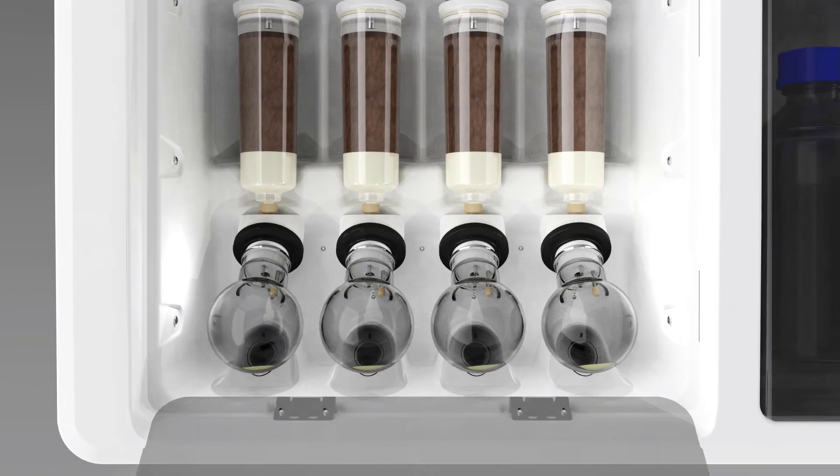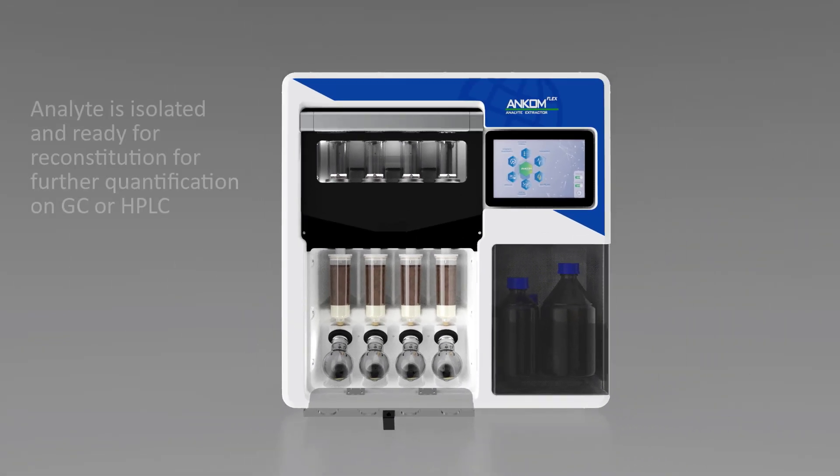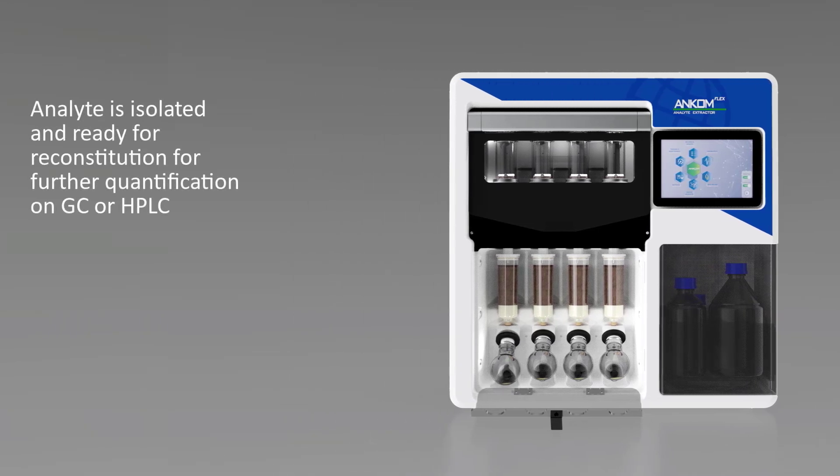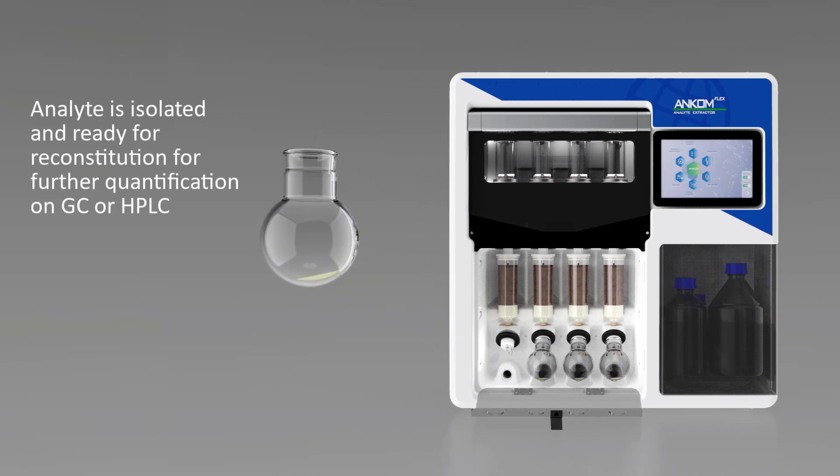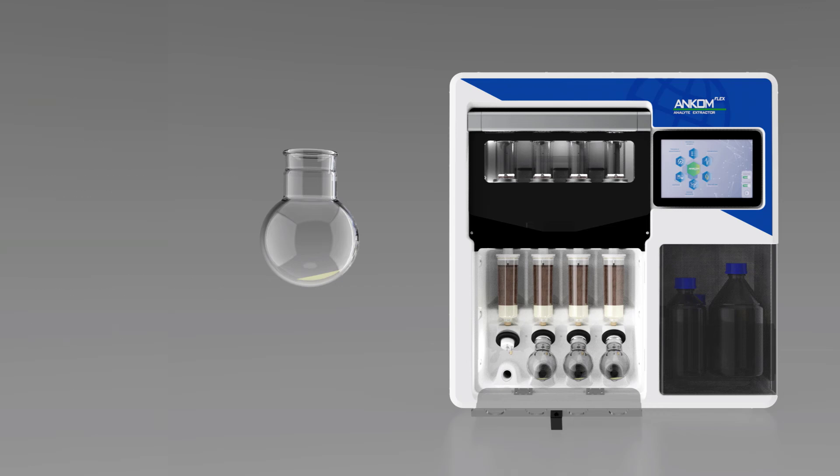The user will be alerted when the analyte is isolated and ready for reconstitution for further quantification on GC or HPLC. This groundbreaking integration of a series of chemical processes vital to fat-soluble vitamin preparation sets ANCOM apart.